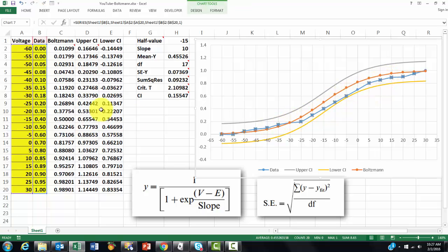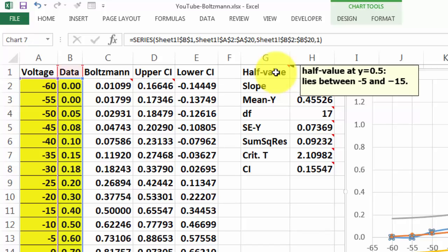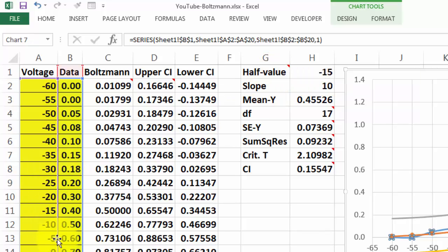When I click on that bluish line, you will see this is basically what we are plotting. Then we guess, this is an educated guess, what the half value is. The half value at y equals 0.5 lies between probably minus 5 and minus 15 somewhere in this range.